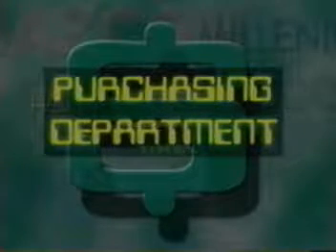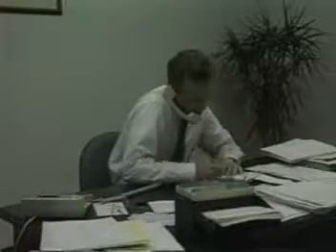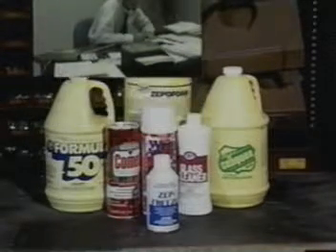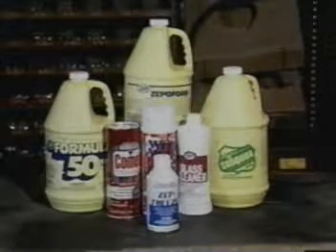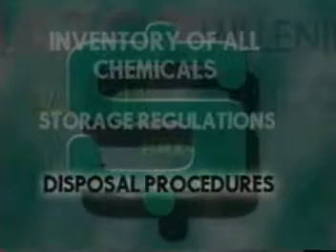Specific rules relating to the purchase of chemicals are required. This provides a control on the acquisition of hazardous chemicals to assure inventories are commensurate with normal consumption rates and stocks are not stored beyond their usable or safe shelf life. The purchasing procedure should include a current inventory of all chemicals, storage regulations, and disposal procedures.